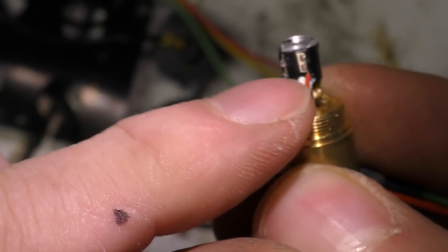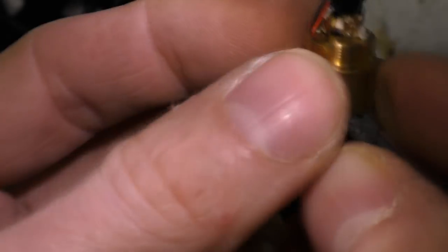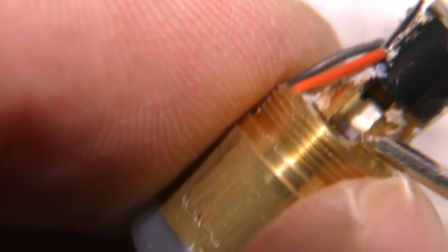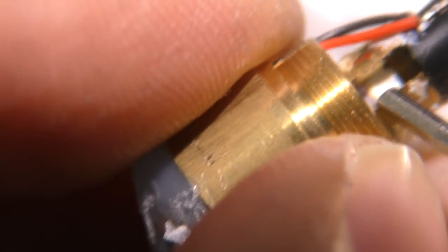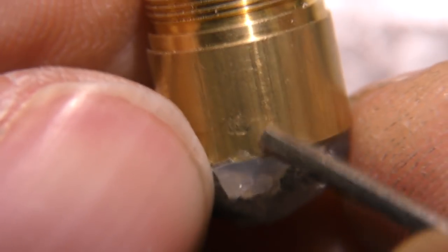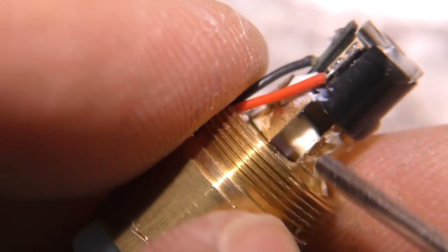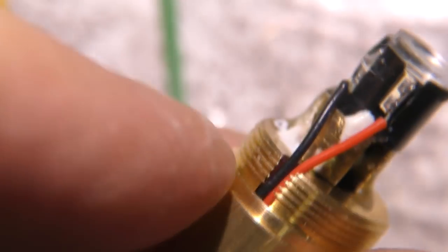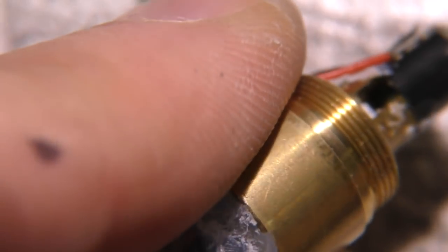Looking at the side of this, I think this thing on the side is a feedback photodiode. Okay, maybe slightly tricky to see, but you see the end there of the actual laser assembly here, and then there'll be the infrared pump diode back here, firing the infrared into this assembly where it lasers at 1064 nanometers and then gets frequency doubled to the green 532 nanometer output. Problem is obviously with a laser like this, you've got no idea what its design current is, but we do have more than one of them, so if we smoke one at least that means we know what current not to go over.